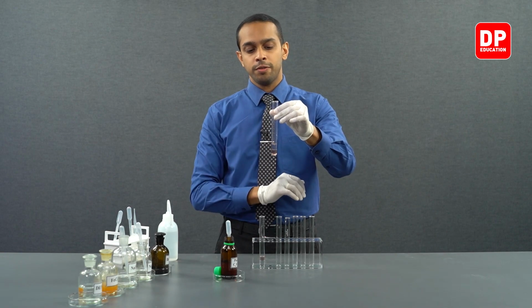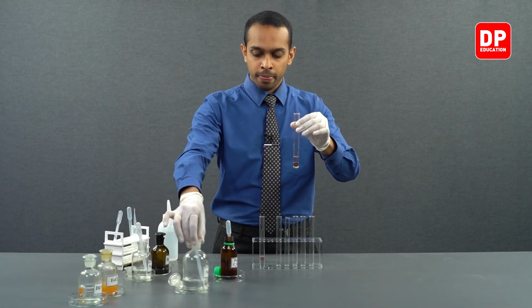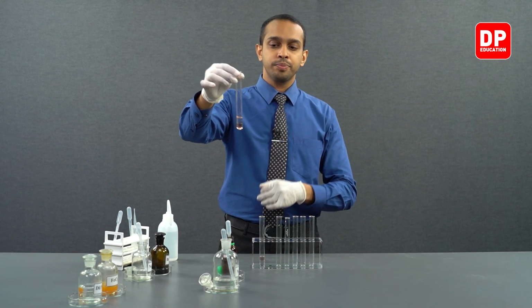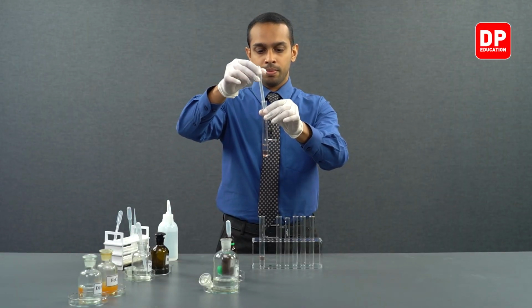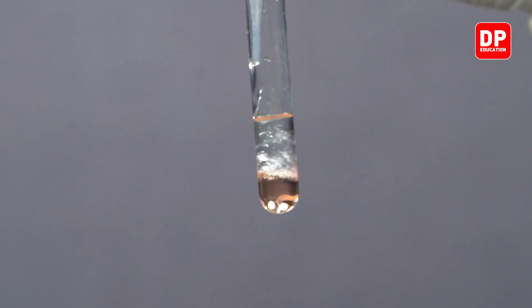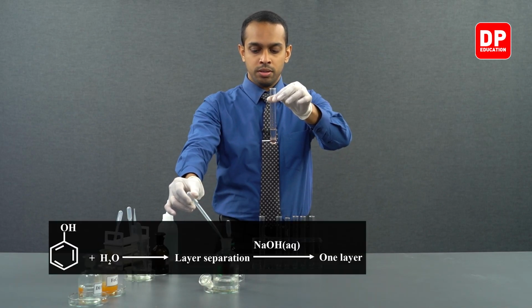Now, to this phenol solution, let's add a small amount of sodium hydroxide and see what the observations are. Note what happens when sodium hydroxide is added to this mixture.